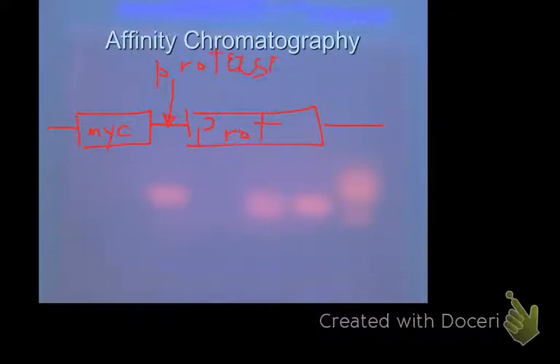What are proteases? They're enzymes, because ASE is an ending for an enzyme. Like OSE is the ending for a sugar, like dextrose, glucose, and ASE is the ending that enzymes get. But what are proteases? They break apart proteins, okay? And they can be very specific for different amino acids, and we're going to talk about it a little bit later on. But you have to be careful because whatever protease spot you put in there, it better not cut your protein too, because otherwise it's no good.